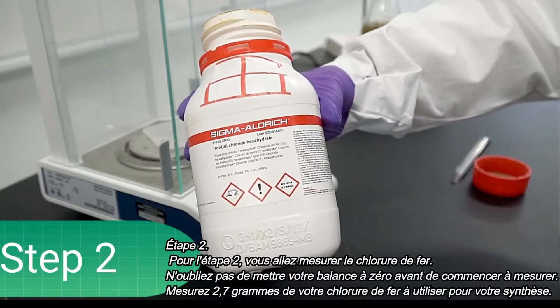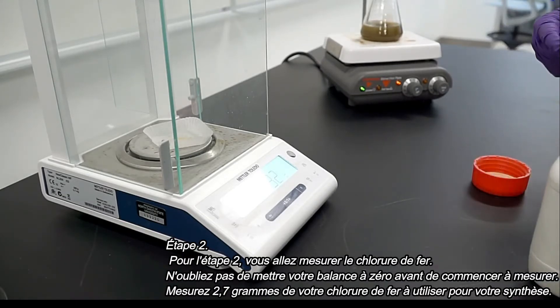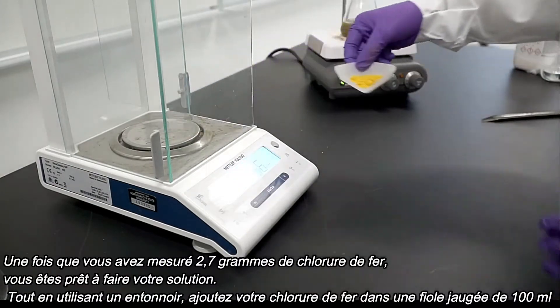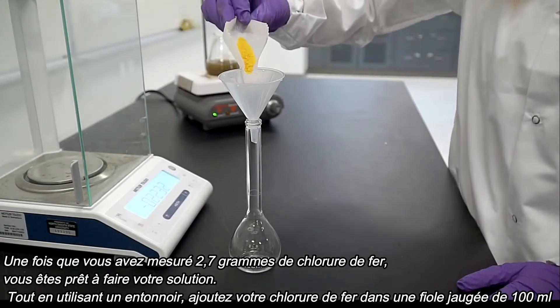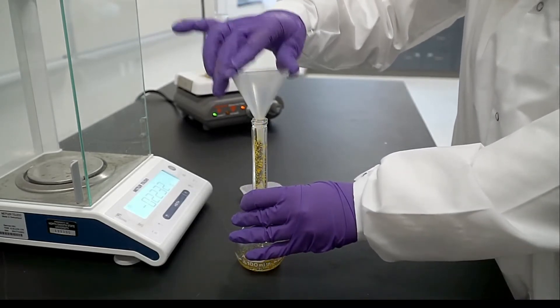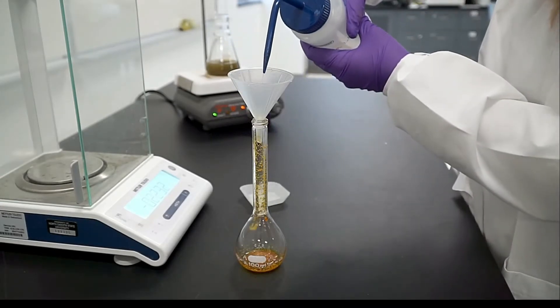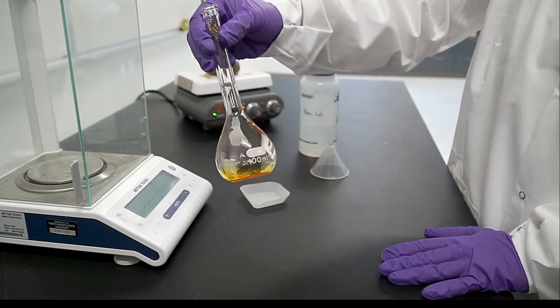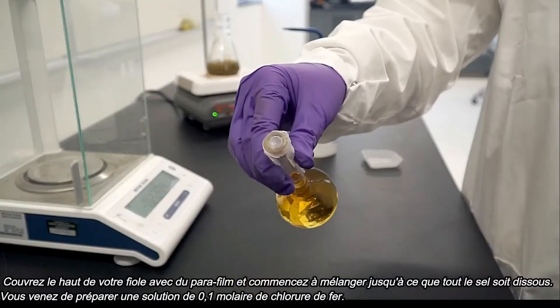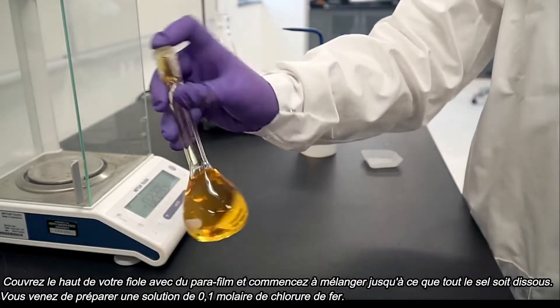For step two, you will be measuring iron chloride. Remember to zero your scale before you begin measuring. Measure 2.7 grams of your iron chloride to use for your synthesis. Once you have measured 2.7 grams of iron chloride, you are ready to make your solution. Using a funnel, add your iron chloride to a 100 milliliter volumetric flask. Begin adding your DI water until you have reached 100 milliliters. Cover the top of your flask using parafilm and begin mixing until all the salt has dissolved. You have just prepared a 0.1 molar solution of iron chloride.